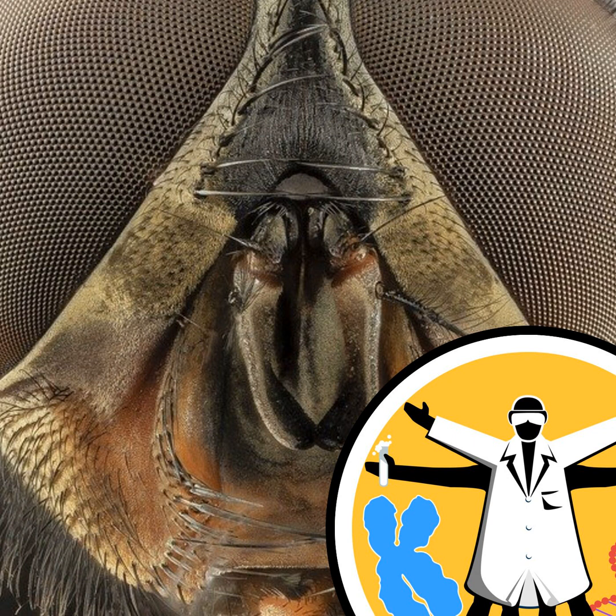What's the risk that you just get overwhelmed by fly, and you never get bacteria? So there is some risk, but like I say, we can sequence very, very deeply, and you would be surprised how much bacteria there are in things, even in humans. For example, if you've ever done one of the tests like 23andMe or Ancestry, where you do a spit tube, those spit tubes can be almost 50% bacteria from the inside of your mouth.